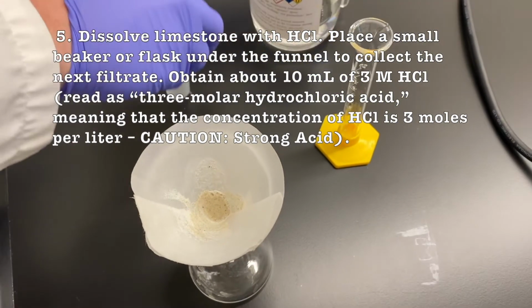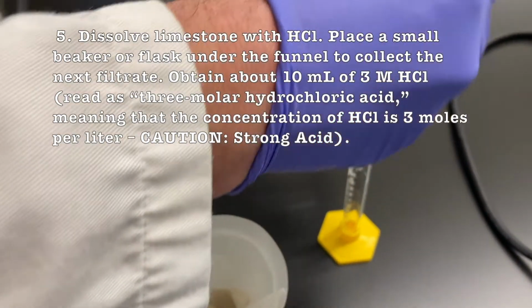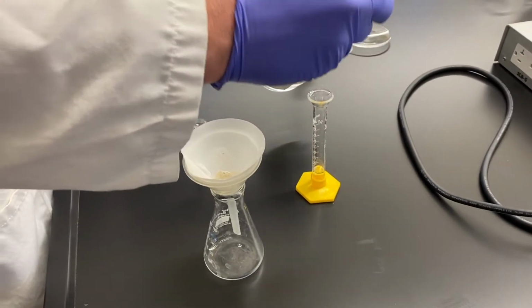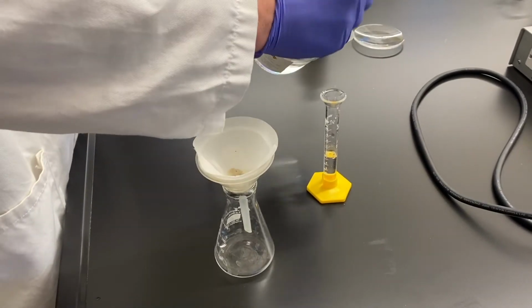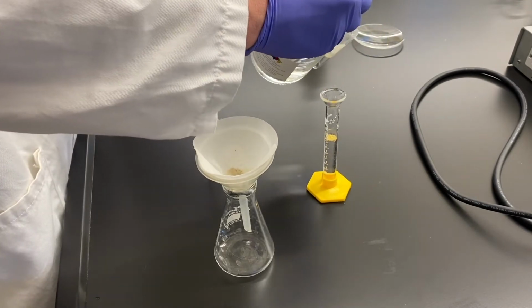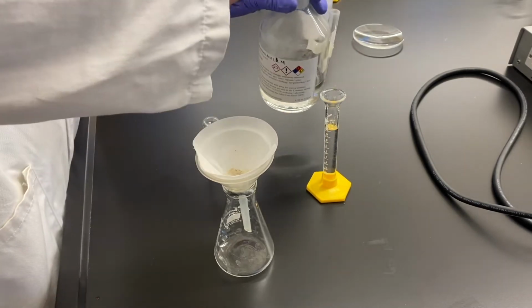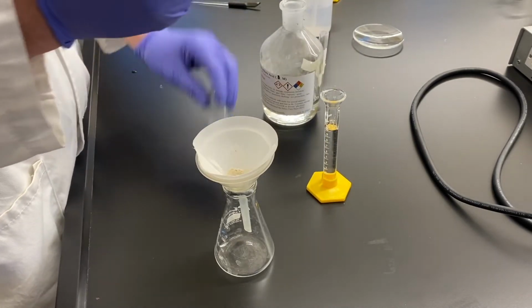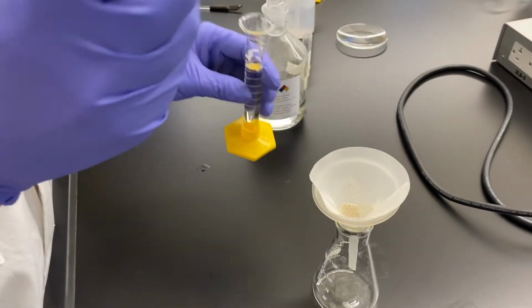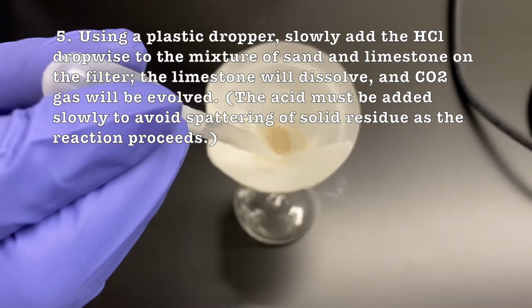So now we have that filter paper, so it has sand and the calcium carbonate. And so when we add this hydrochloric acid, the calcium carbonate will react with the hydrochloric acid. You'll see some carbon dioxide bubbling off. But more importantly, the calcium is going to go through and dissolve in the water and be in the water that goes through the funnel. And it's going to be calcium ions.